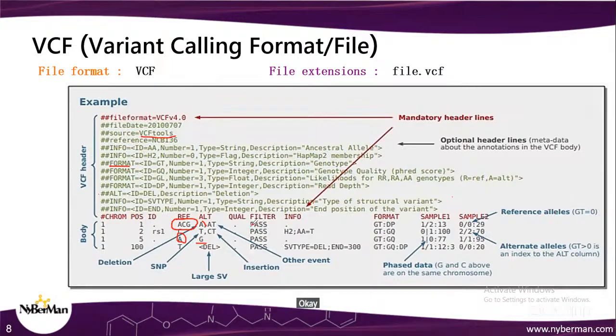Okay, and then there will be the quality score and the filter pass, which says whether this particular filter is passed or not passed. That is based on the tool that you are analyzing, and whether this particular type of mutation or change is already reported there or not.